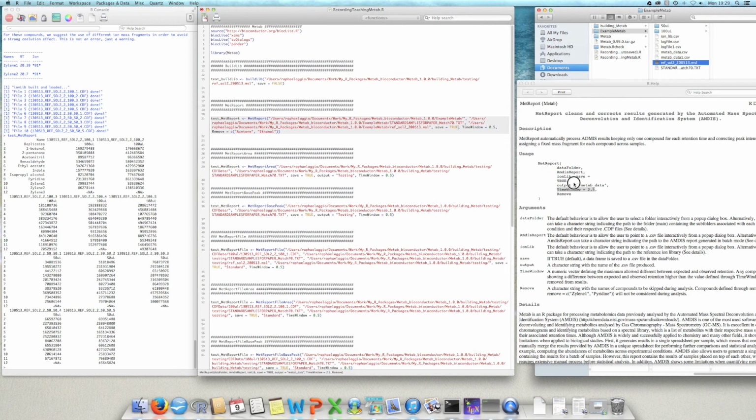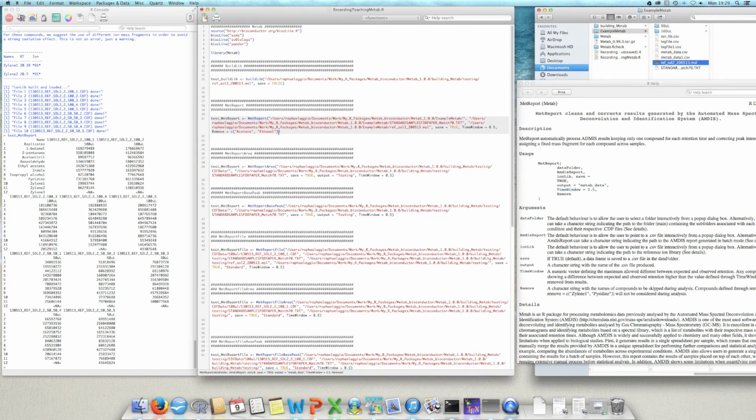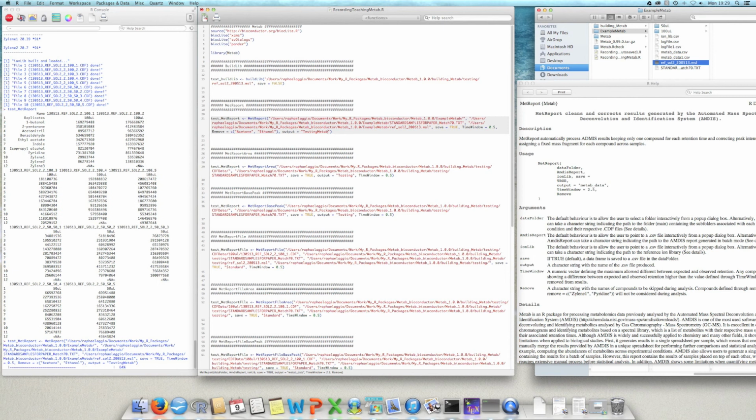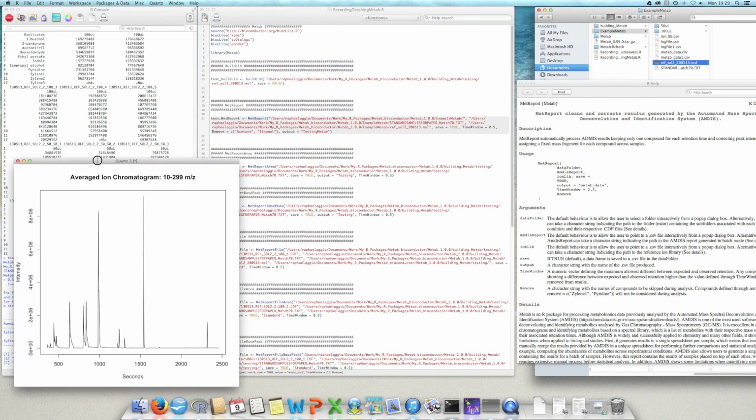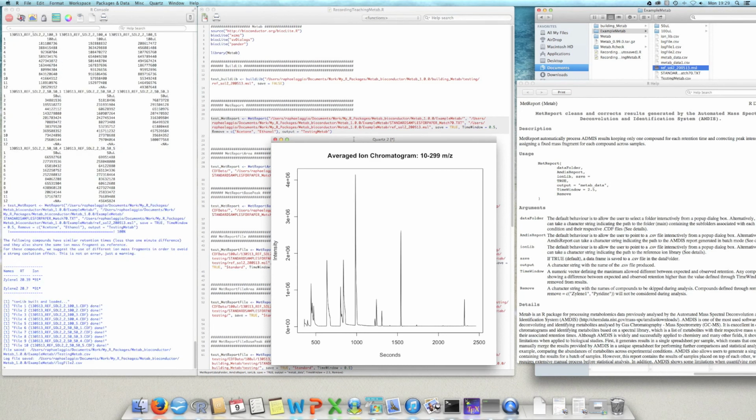Okay. If I want to save the results, I can put here true. In this case, I can define the output. I'm going to change the name of the results. So the output, I will give a name, testing Metab, and analyze again. Analyzing. And you have the results.